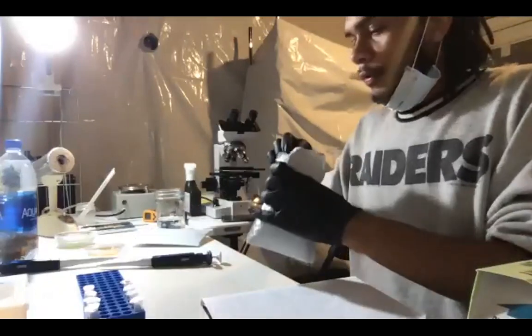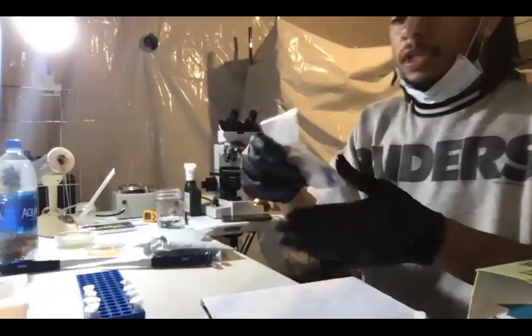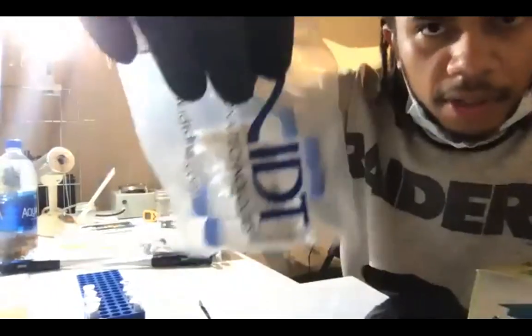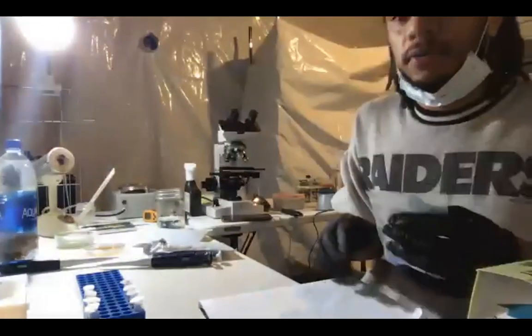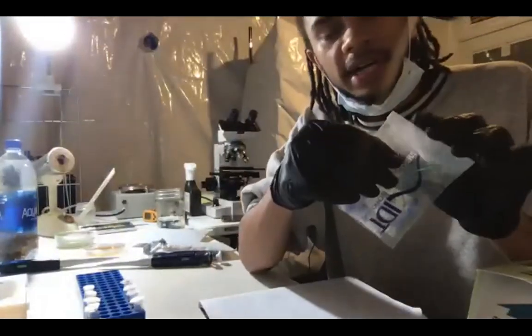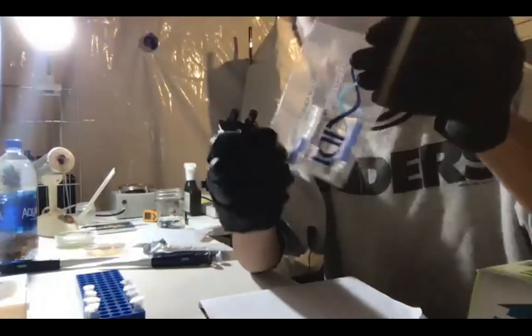So the first thing that we're going to do is prepare our primers. This is the way the primers come to you. I get these synthesized from IDT DNA. Like I said before, I'll email you guys the sequence that you can send to IDT DNA to synthesize these for you.